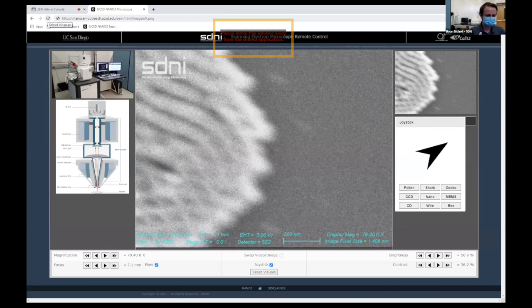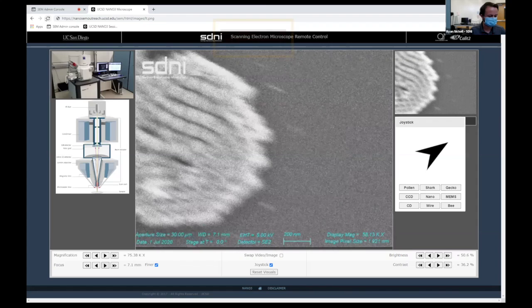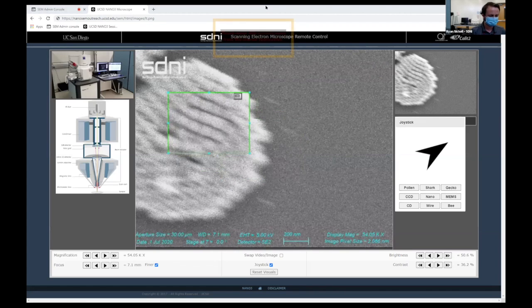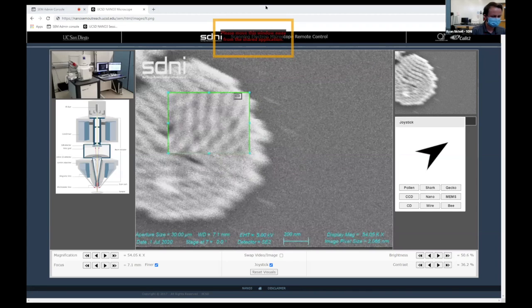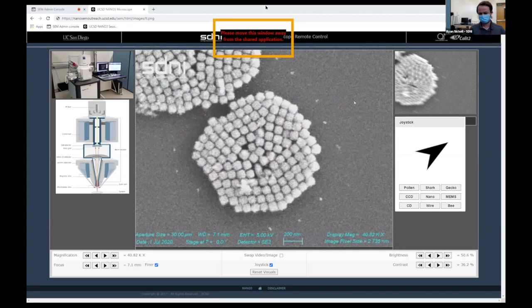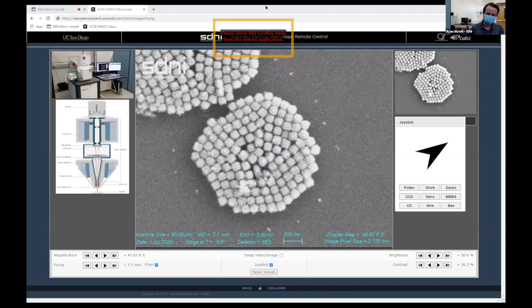I want to first of all address that we're almost seeing it. I want to help you out a little bit. This is actually the toughest sample to focus on. And I don't want everyone else sitting here looking at nothingness while I explain stuff. So I need to really tweak some extra settings, which are a little bit complicated to talk to high school children about, so I don't usually talk about them. But there are some extra adjustments I have to make. So there are your nanoparticles. Wow. You can look at the scale bar and see that they're about 100 nanometers in size.